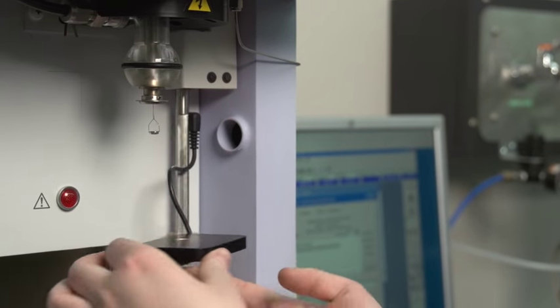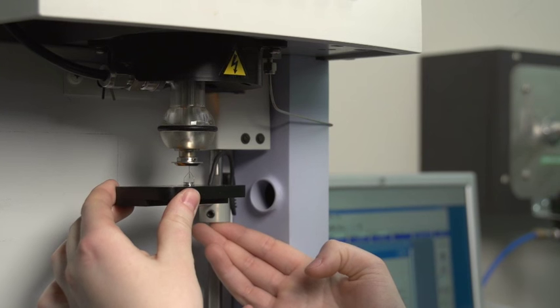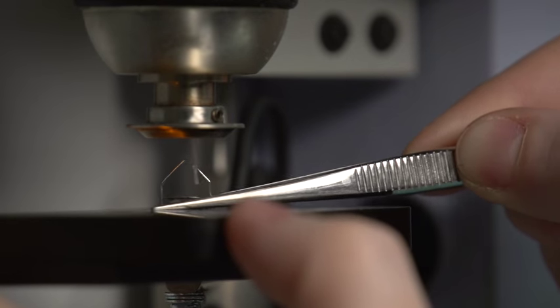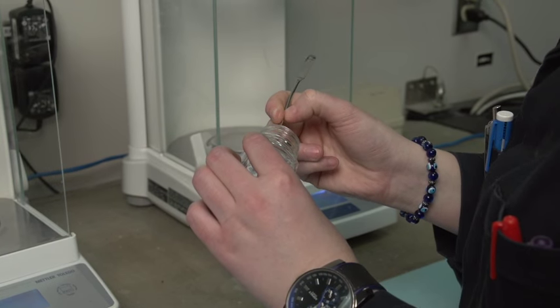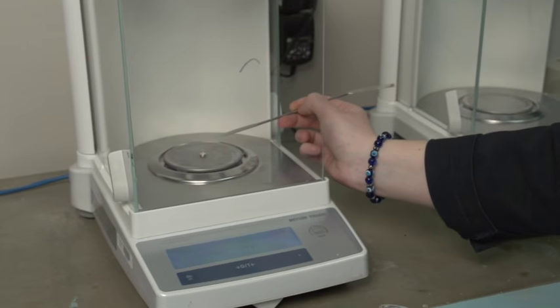Swing the platform to the left and raise it up so that the pan and stirrup lift off the balance hook. Push the stirrup and pan over the side of the platform. Remove the stirrup and pan and add 7 to 9 milligrams of sample to the pan using the analytical balance as a guide.